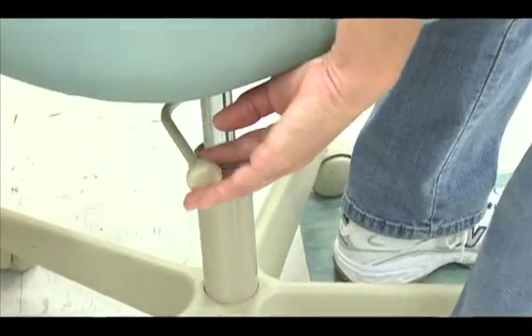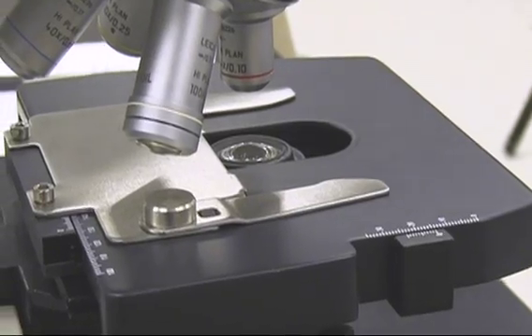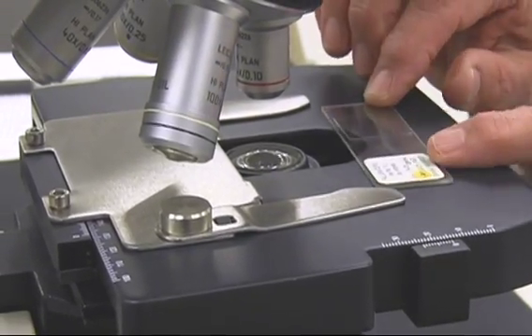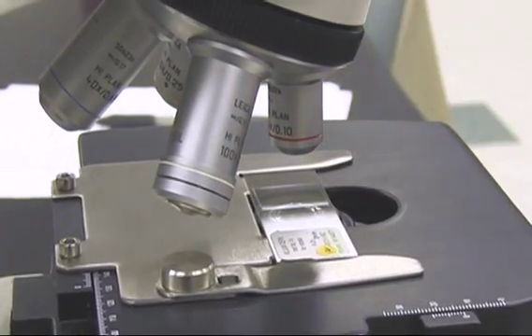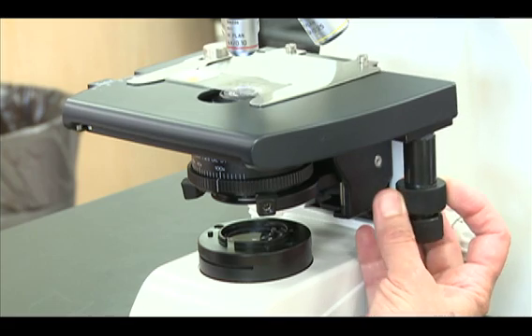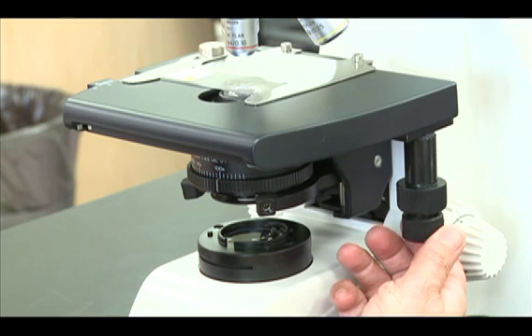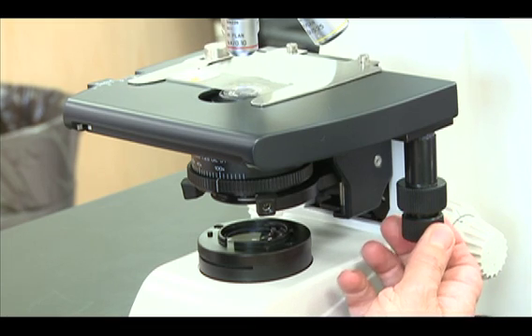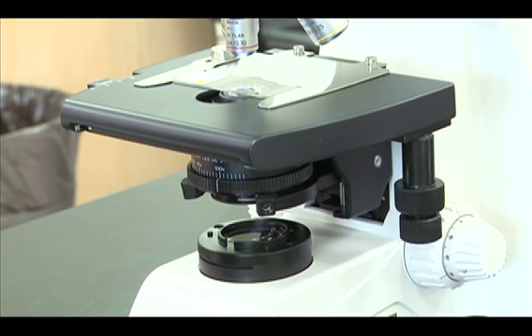Adjust your chair for comfortable viewing. Guide a slide gently between the stage clips and align it with the back of the holder. Center the slide over the circle of light with the stage controls. The lower knob moves the stage left and right. The upper knob moves the stage front to back.